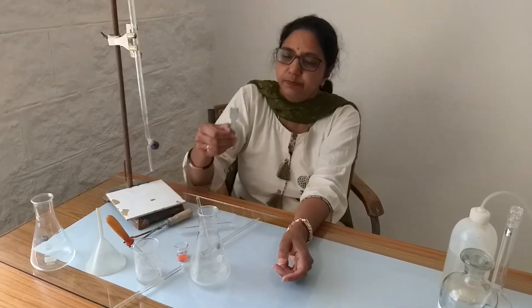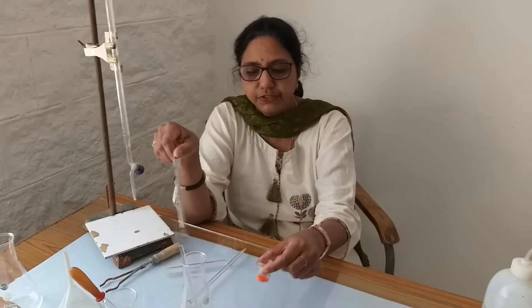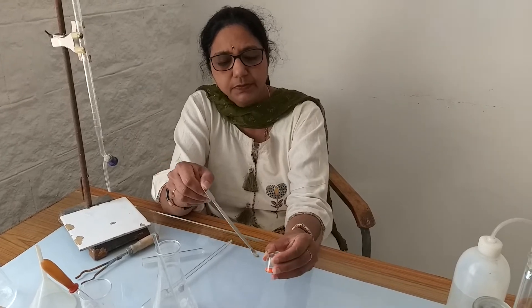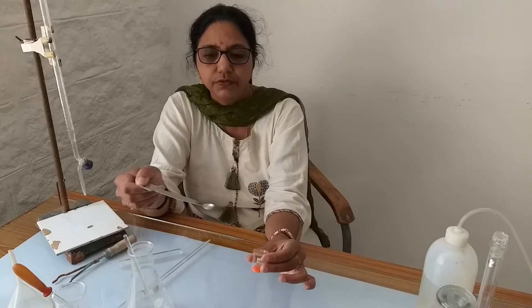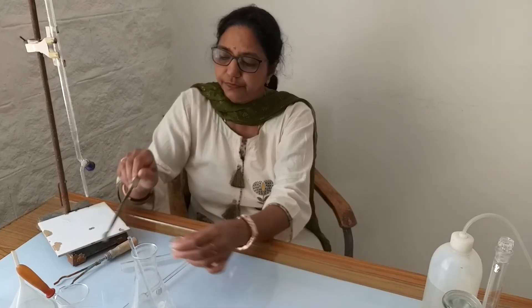This is a spatula. The spatula has a small bowl-shaped structure at one end and a handle for holding. We can take out the salt with the help of the spatula and transfer it to a weighing bottle. This is a small glass weighing bottle — plastic can also be used. We take a small amount of salt with the spatula and then weigh it on the weighing machine.